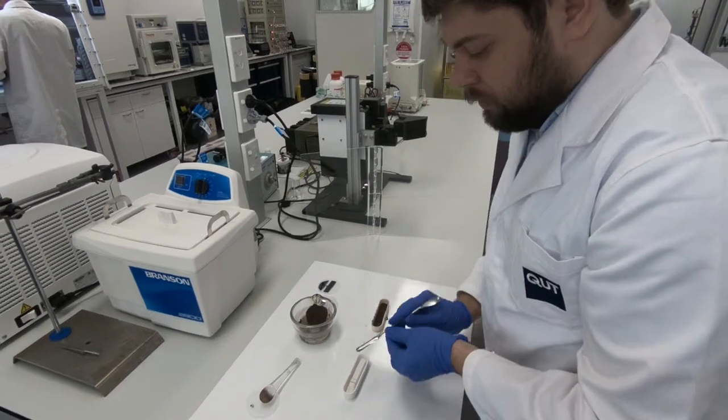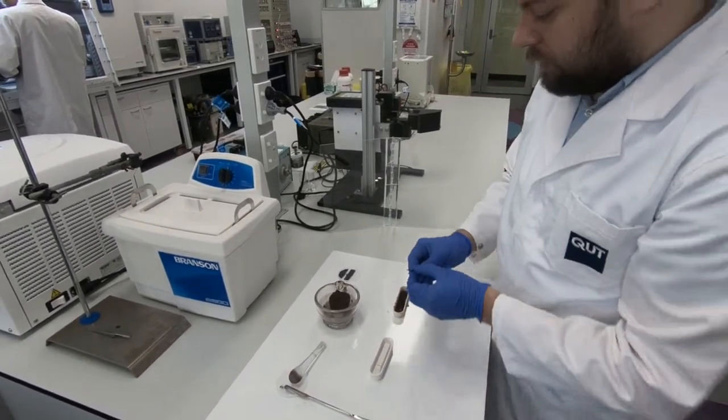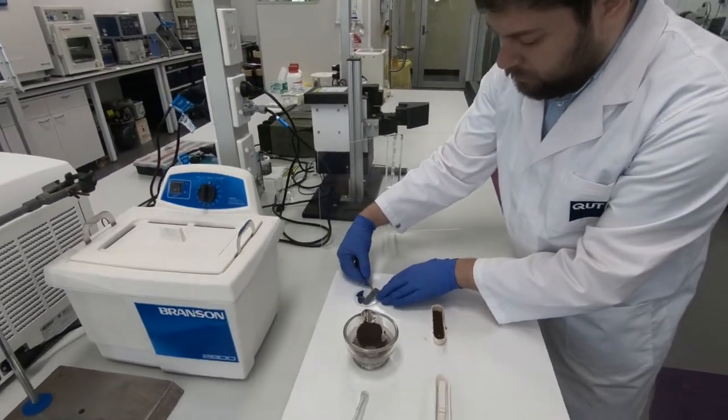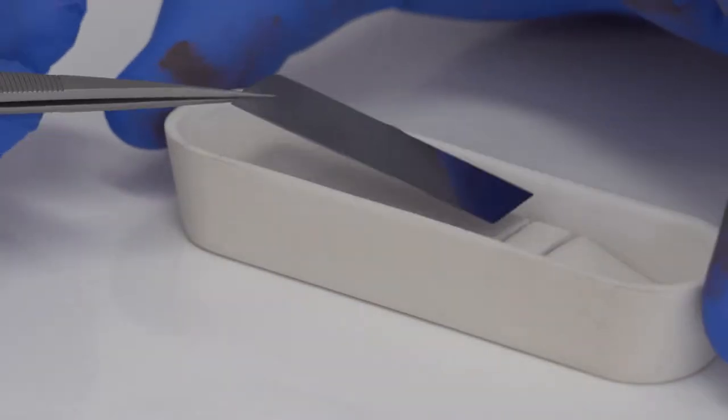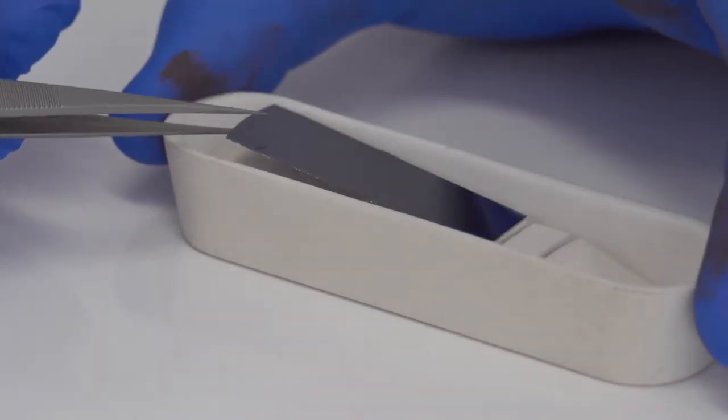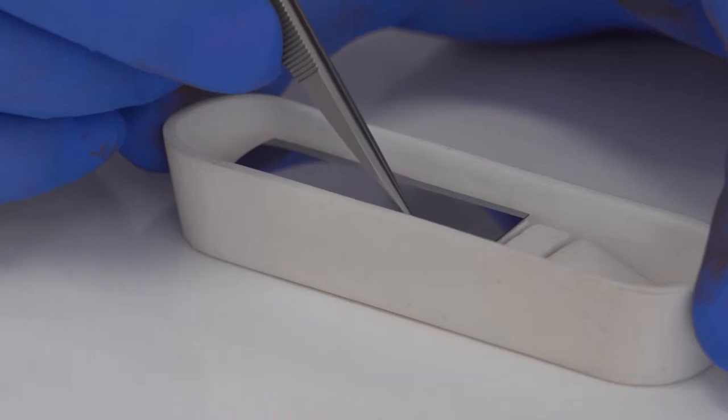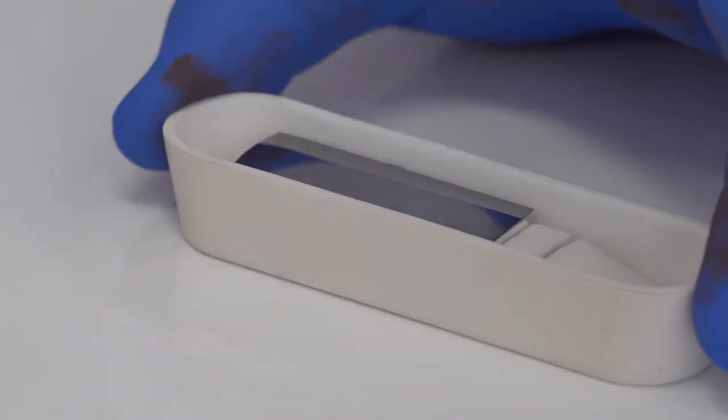Now when it's ready, we can put our substrate, silicon wafer, in another bowl. And this is the actual place where our nanostructure will be grown.